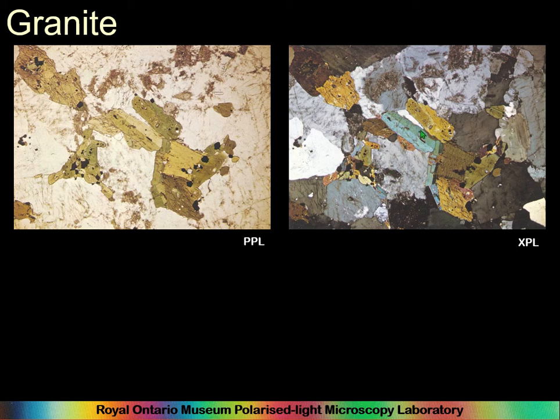You've seen this before. Here are some nice amphiboles, green pleochroism. Here you can see the two cleavages. Here's some biotite. See the sparkly extinction, typical of biotite. And also in here you can see there are feldspars and quartz.